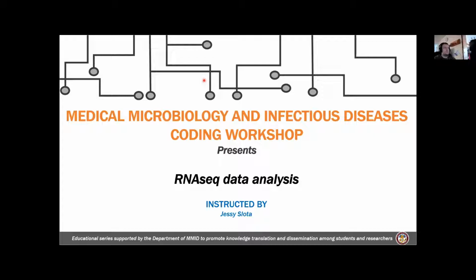Jessy is a graduate student in the Department of Medical Microbiology and Infectious Diseases at the University of Manitoba, supervised by Dr. Stephanie Booth. Today, Jessy will provide basic analysis of RNA-seq read count data, such as processing raw files, normalization, differential expression, and functional enrichment analysis in R using DESeq2 and enrichR packages. You'll also get to learn awesome RNA-seq analysis-specific data visualizations.